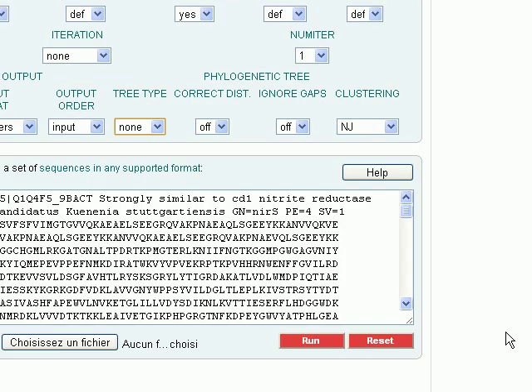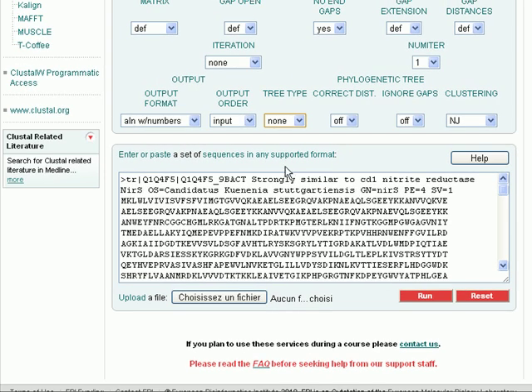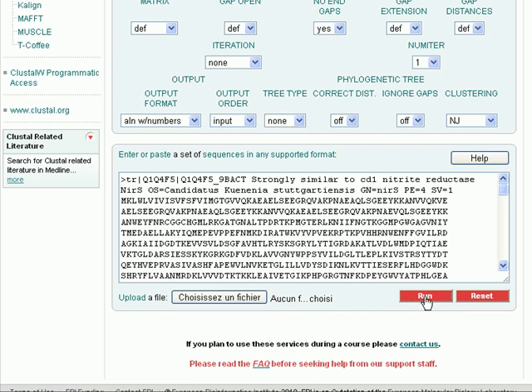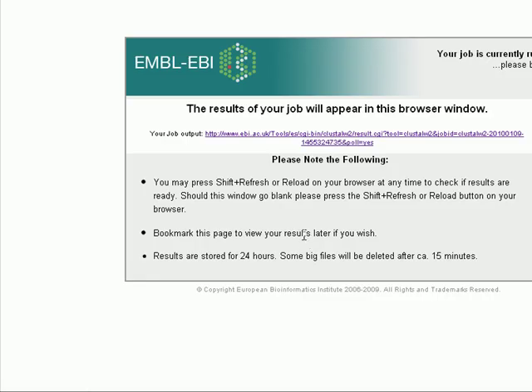I will click run and we'll wait for the result page to appear.